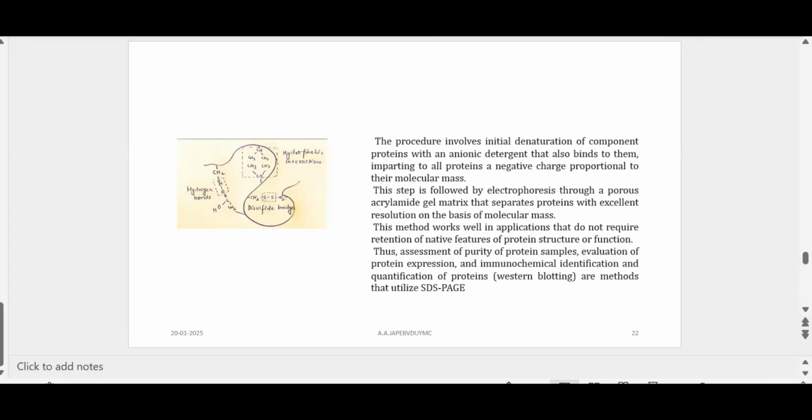An example where phenol, water, and acetic acid as a solvent system in addition to urea is used is ribosome subunits. So you know ribosomes are made up of different subunits. So 16S, 5S, 5.8S, etc. That is what you talk about, right? These are the RNAs, 5.8S RNA, 16S RNA, and along with that you have proteins associated.